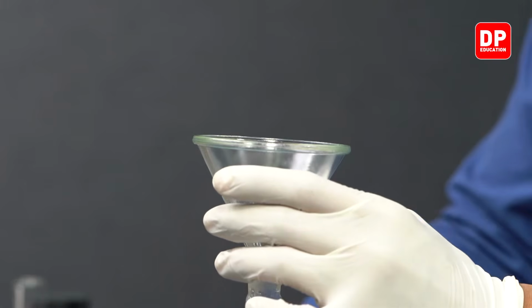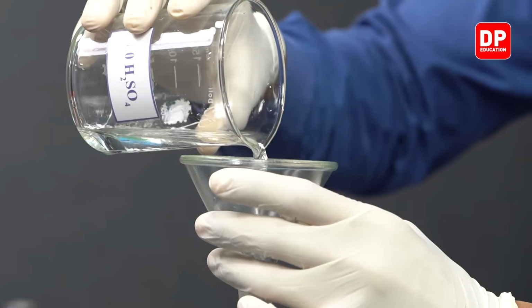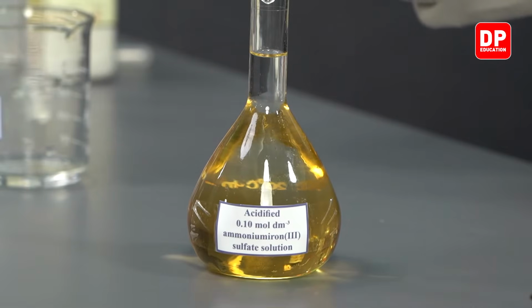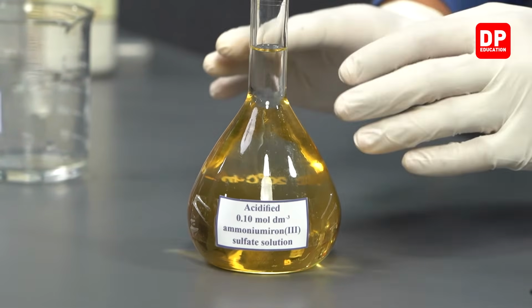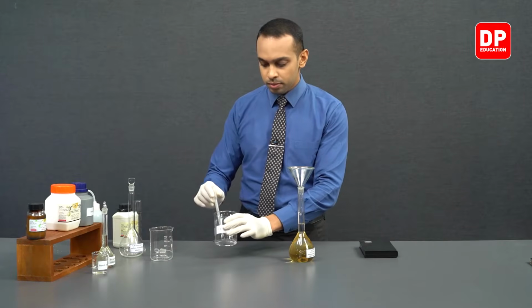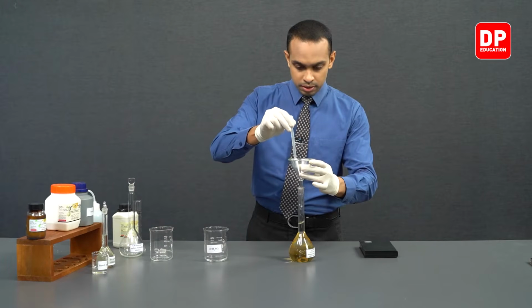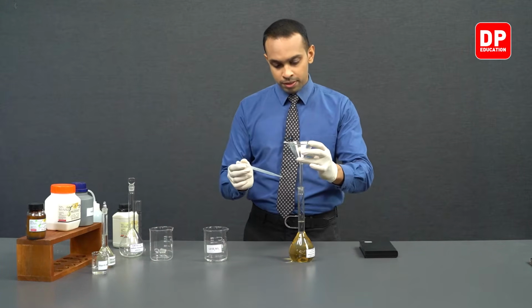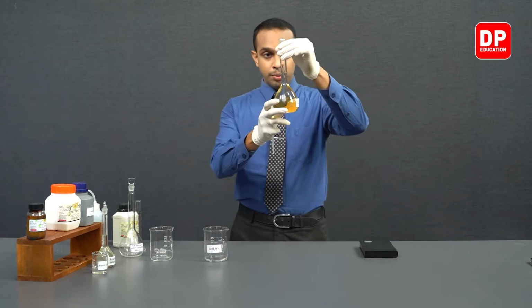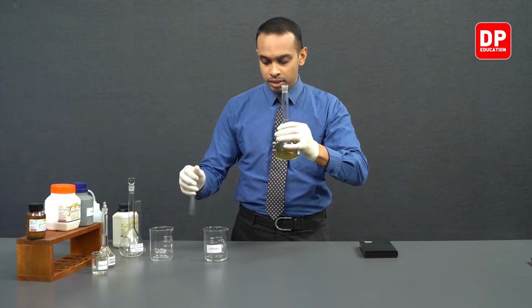And finally, we can start to add sulfuric acid all the way up to our calibration mark. When you're adding the last bit of sulfuric acid to this volumetric flask, we can use a dropper and we can transfer the last few drops of sulfuric acid with the use of a dropper. We have our calibration mark up here, and we have quite a bit of sulfuric acid to add.